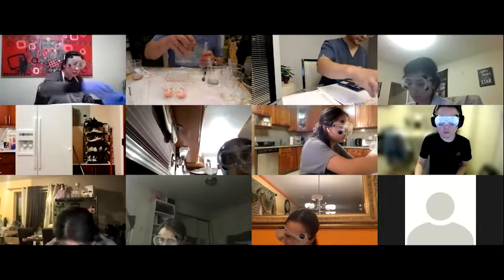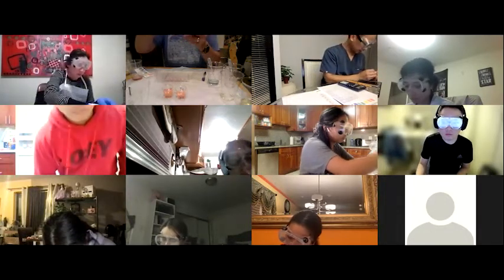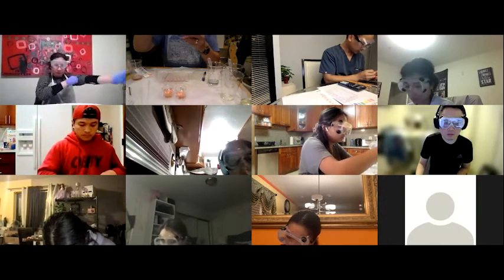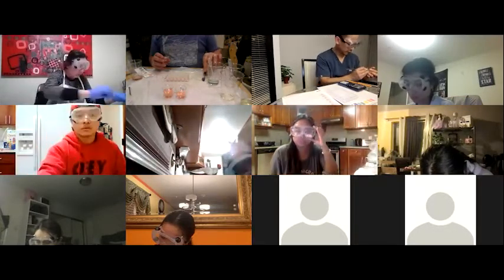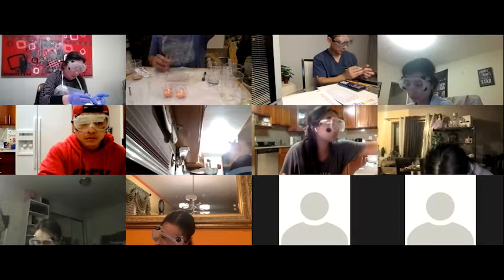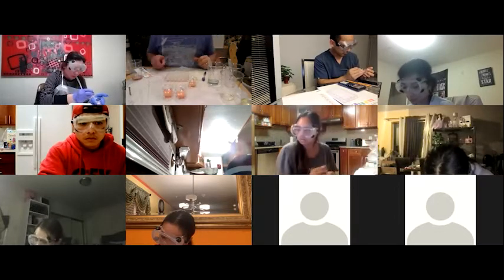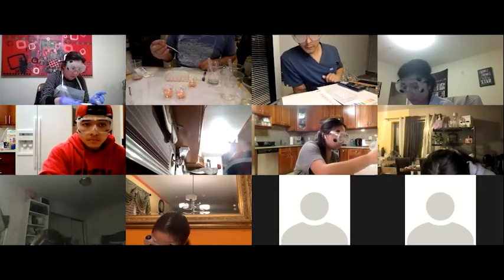That might be a little faster. I'm going to see if that's any faster. Not really. I think if you use the graduated cylinder to add the 2 mils, there's more chance of spillage, so I'm not going to do that. I'm going to stick with my transfer pipette.